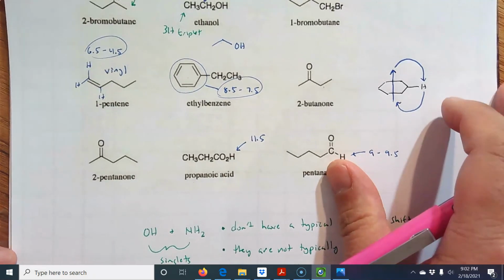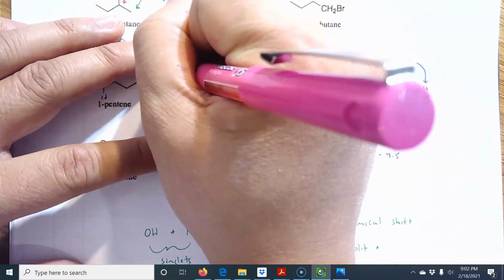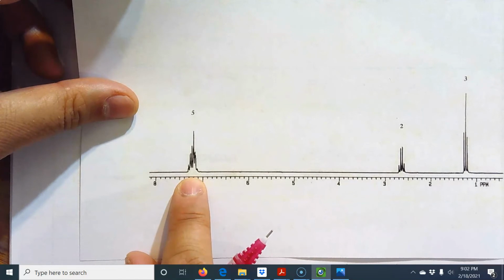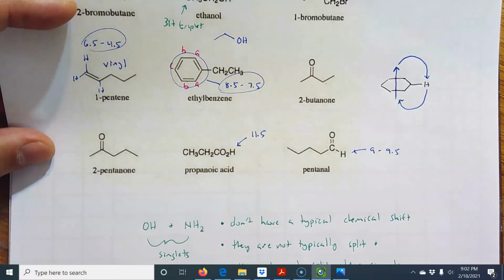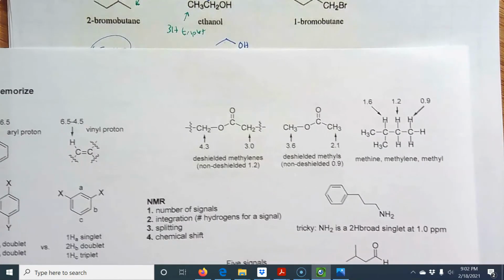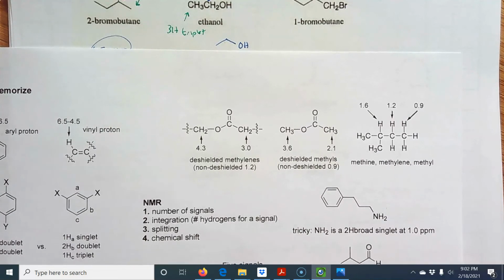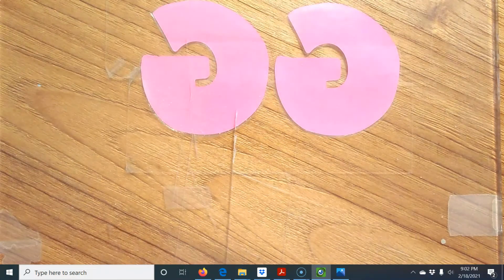So when you're labeling the equivalent hydrogens, you're fine to say A, B, C, A, B. Just realize that in practice, A, B, and C on the ring are kind of right on top of each other. Okay. Now, I wanted to tell you the story about esters. I'll introduce it here, and this is going to be kind of important, especially if you think you have an ester as your proposed structure, because I can guarantee you. Here's the story of ester. I'll do it briefly.